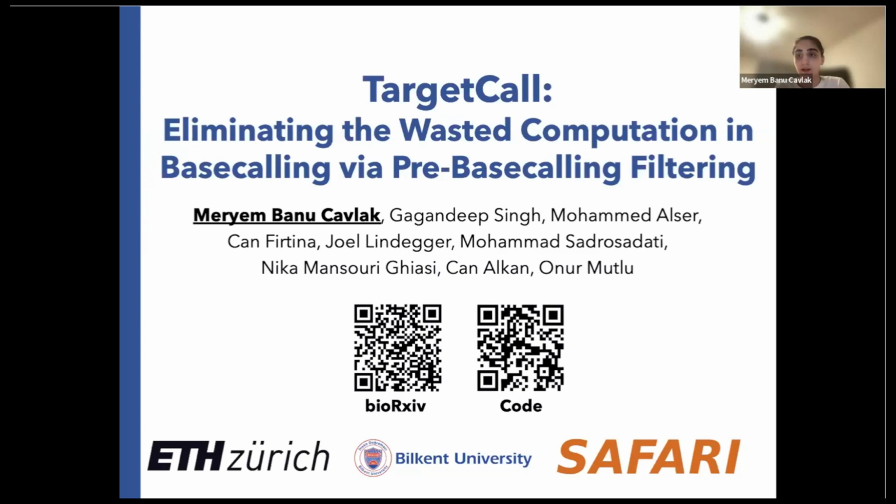And SquiggleFilter, we could compare against it, maybe not their hardware implementation, but their underlying dynamic time warping algorithm. But that would be a very slow method, because it's a quadratic time algorithm, and quadratic time algorithms are costly even for sequences.